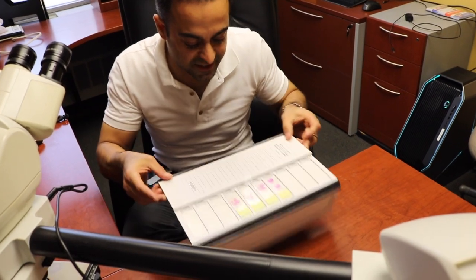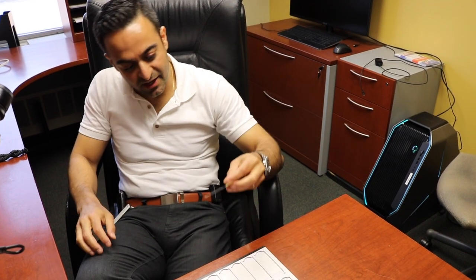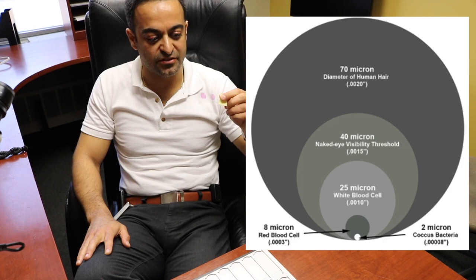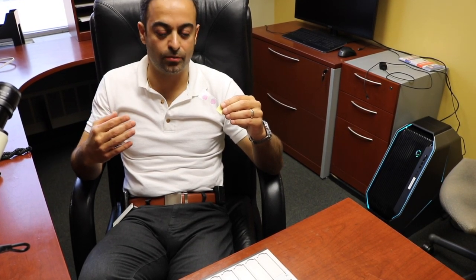Now what we're going to see today are very thin glass slides of brain tissue, and it's important to know how these were generated. As we'll see in another video, we have to prepare tissue to be converted into these glass slides, which are about 5 microns thick. These are stained with a dye known as hematoxylin eosin that allows us to better differentiate certain aspects of the cells under the microscope.